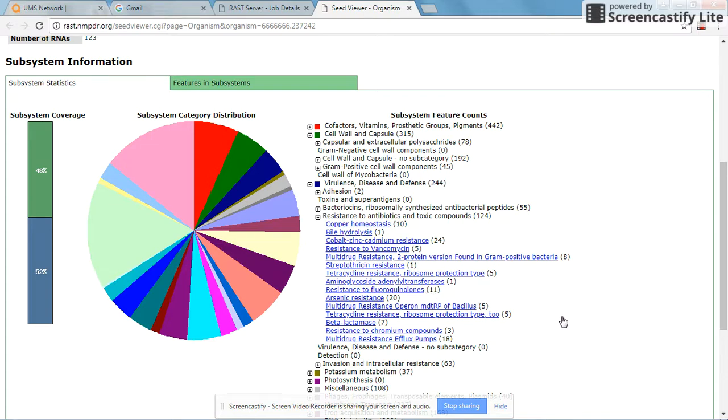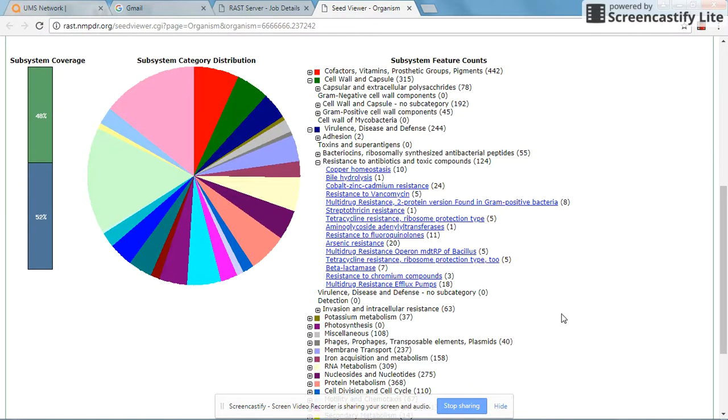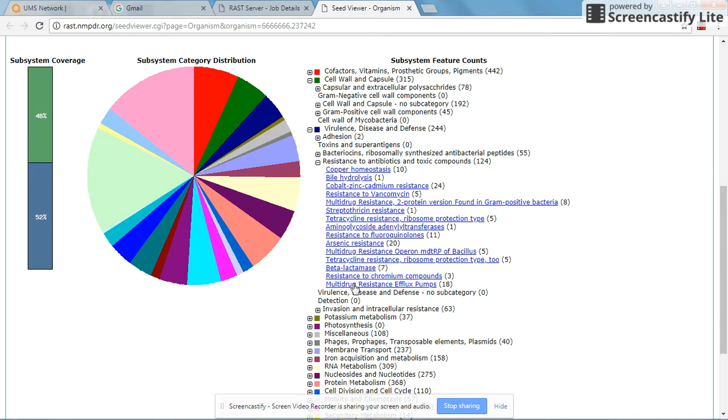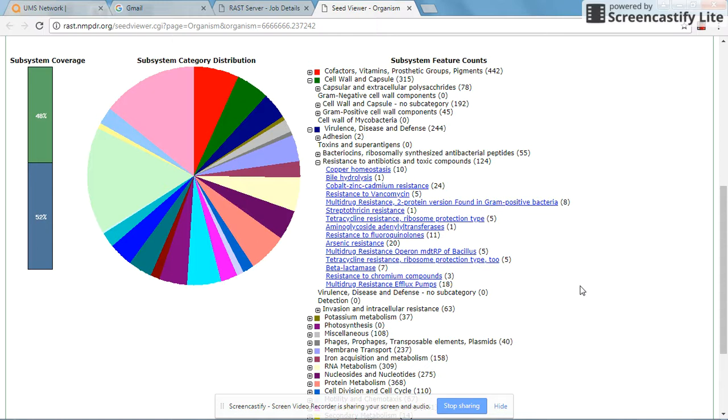This is a soil microbe which was isolated from an acid-mined drainage site. You have arsenic resistance subsystems, and we have systems for copper homeostasis as well as resistance to chromium compounds. This gels in well with the hypothesis of this organism being one which can resist toxic concentrations of metal ions.